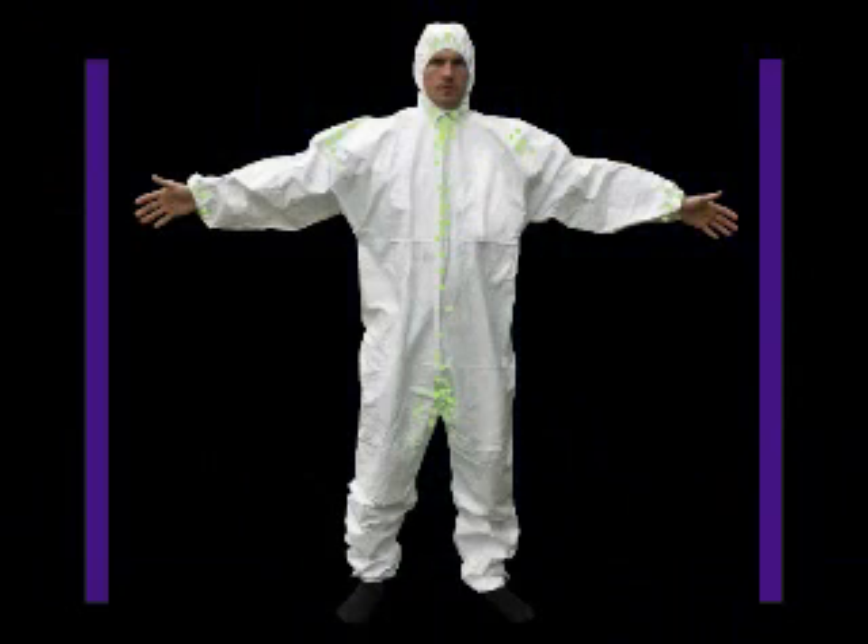We carefully examine the exterior of each suit. Seams, hems, and sealing flaps are the most likely places where contaminant tends to gather. Even after thorough decontamination, a lot of fluorescein dye remains on the outer suit. Some configurations showed a lot of leakage, particularly around the neck. The seams at the groin and shoulders were also vulnerable.